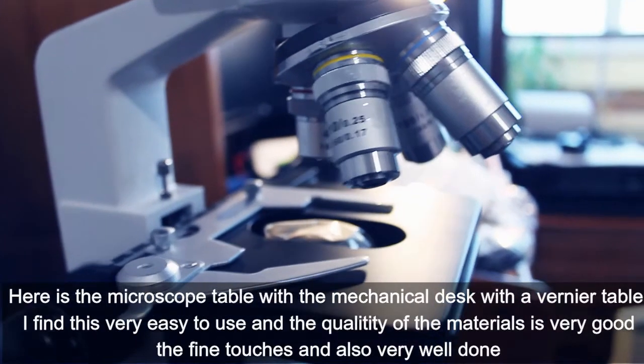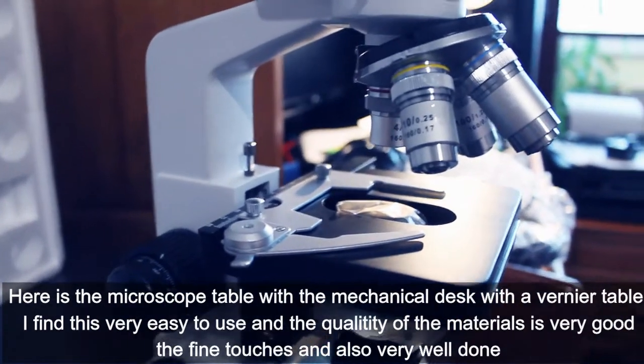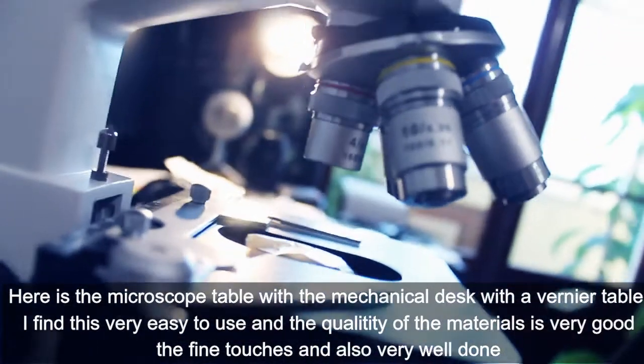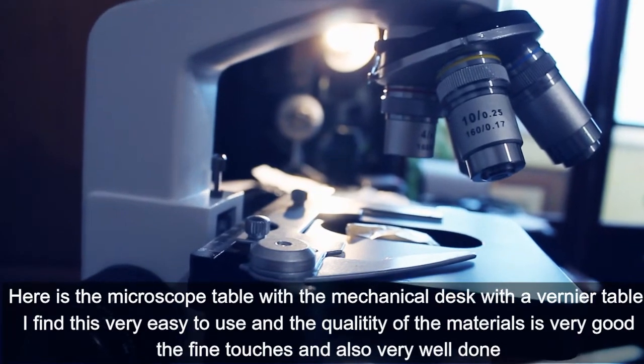Here is the microscope table with the mechanical stage. I find this very easy to use and the quality of the materials is very good. The fine touches are also very well done.